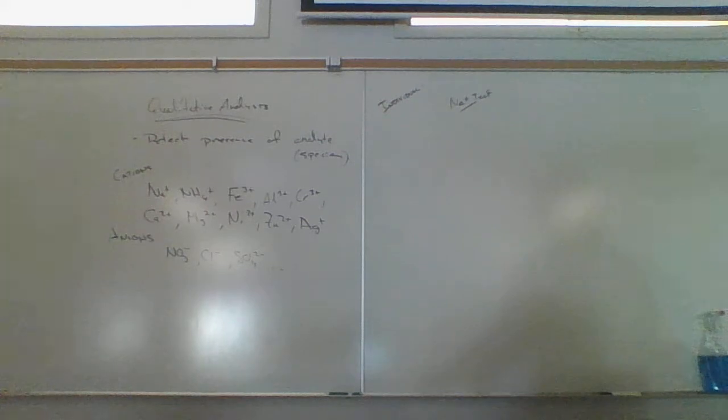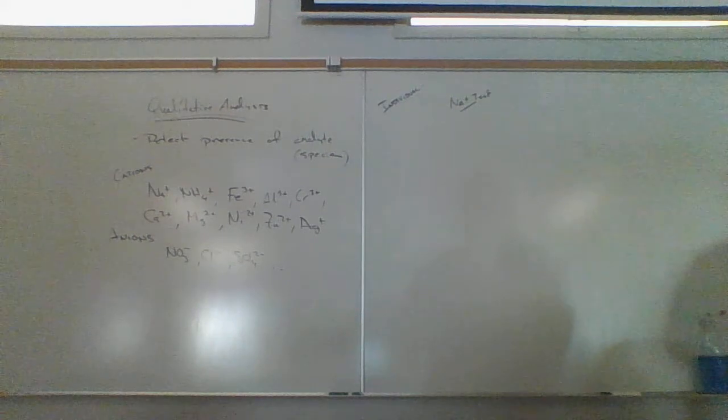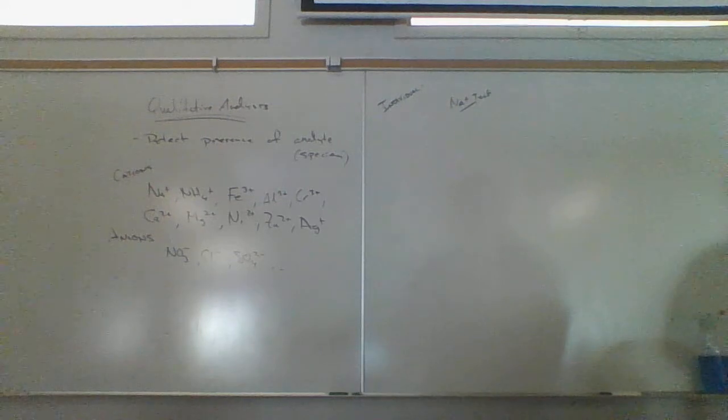Okay. Well, it's still a little bit, but not that much. And then what do you think about tap water? Does tap water have sodium ion in it? Yeah? Probably? All right, let's test our tap water. So I'm going to hit this. And so I'll just get a little bit of tap water on the end of the wire and let's take a look. Here. Do you see that? Yeah, so tap water is testing positive for sodium ion. I mean, there's a pretty bright orange flame.